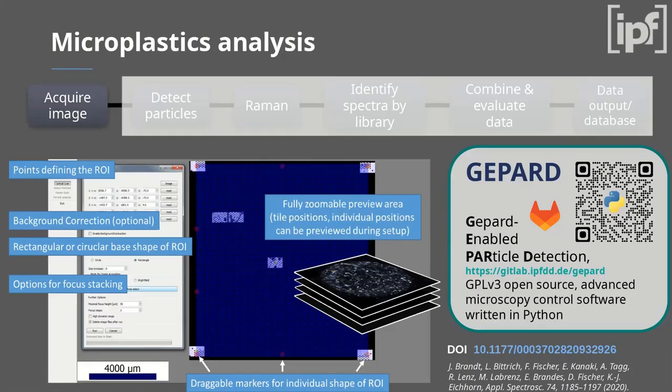The particles in our case are on silicon wafer filters. That means we have an extremely plain and smooth surface where the particles were filtered onto, and where we can measure them, their material, of course, but also their different shape, size, properties.